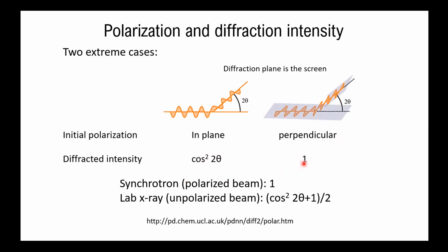And in the practical situation, we typically encounter two cases, one in the lab X-ray, one in the synchrotron, as our group would say. For the synchrotron, we are talking about this specific case where we have no intensity reduction. We have the ratio of diffracted X-ray to the incoming X-ray of 1.